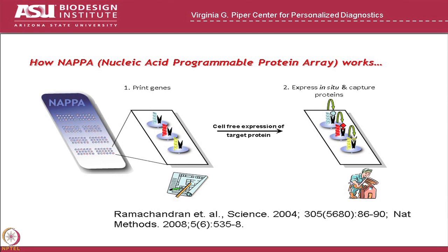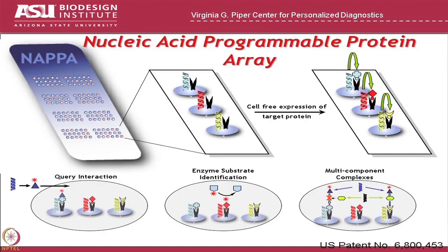Then on the day of the experiment, we add a cell-free extract, make the protein and capture it, and then we display the protein at that time, fresh. And so the idea of NAPPA is that we can do all kinds of studies on it. We can do interactions with specific protein queries, enzyme substrate modification, we can even build multi-protein complexes.